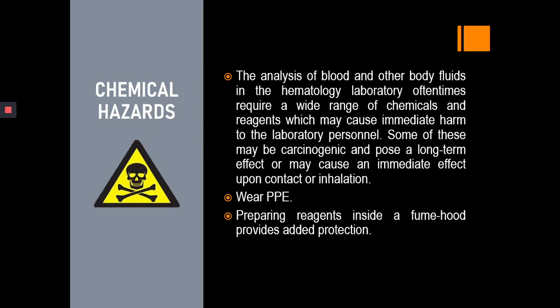That's why when we handle our chemicals inside the laboratory, it is also required that the person wear personal protective equipment. Aside from wearing the personal protective equipment, these reagents must be handled inside a fume hood because the fume hood provides an added protection.